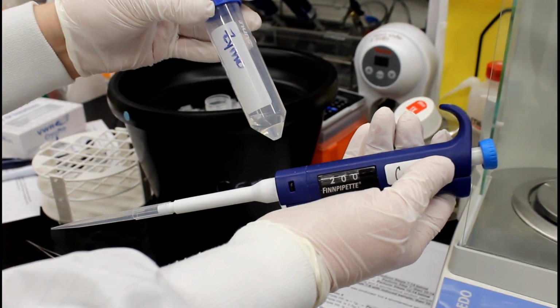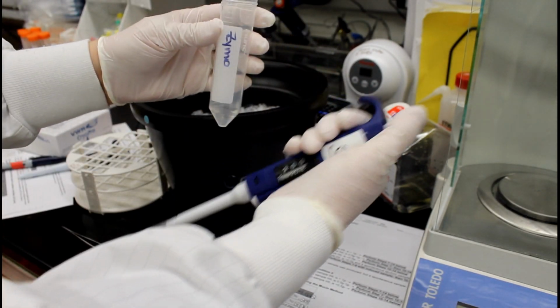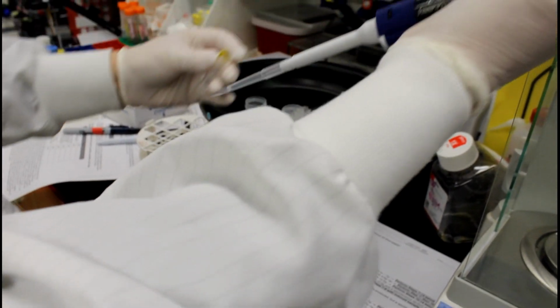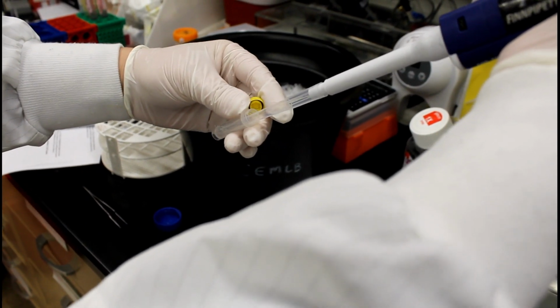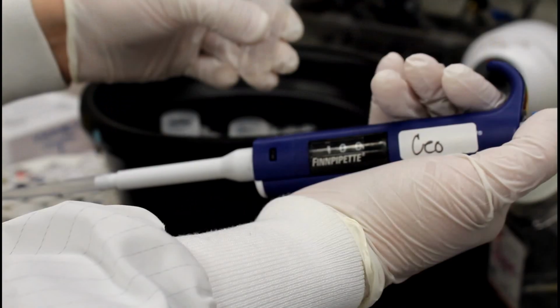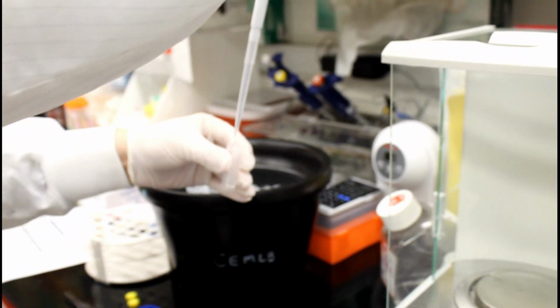Next, add 200 microliters of Zymo Research RNA DNA Shield to the sample and mix it. Next, divide the sample into 2 equal aliquots, 100 microliters each.